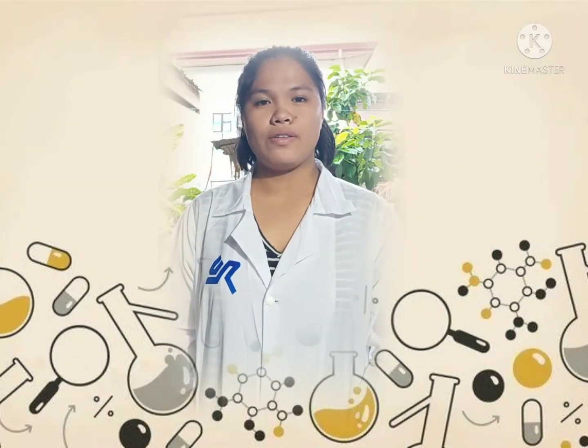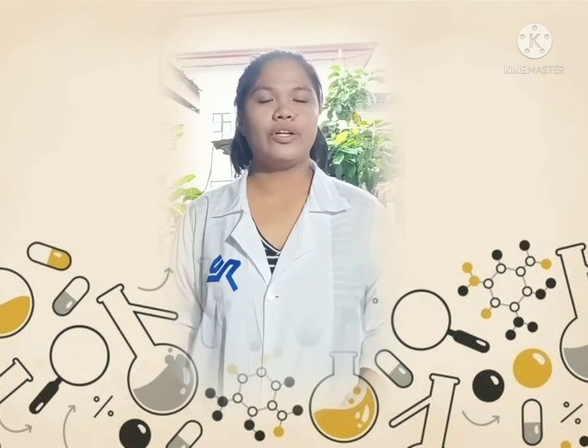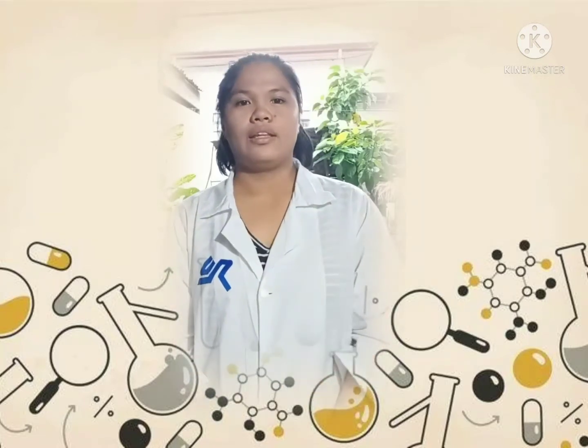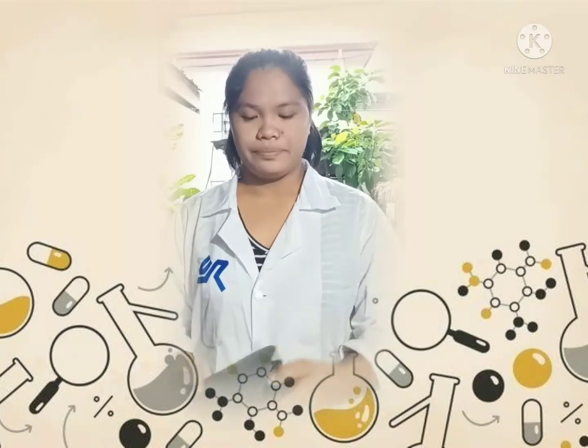First, we need to prepare ourselves and prepare the things that we need. Wear your lab gown, and then next is wear your lab gloves, and then next is prepare the dissecting kit like this.